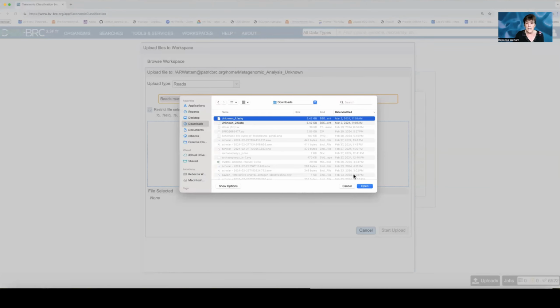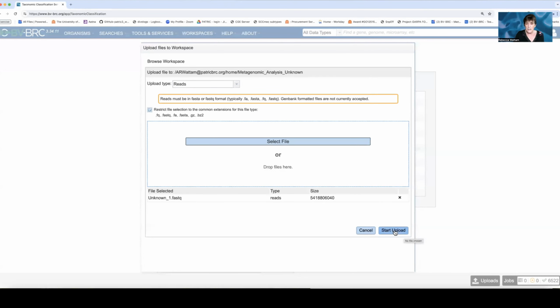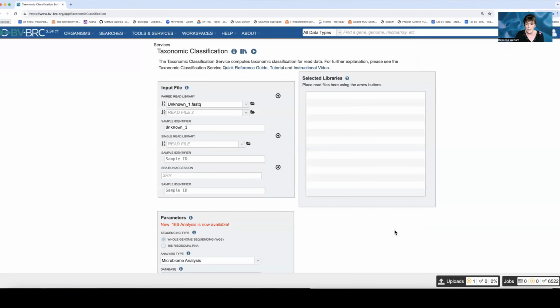So I'm going to click on that and say open it, and then I'm going to start the upload. Once the upload starts down here in the job monitor, you can see that it'll show the uploads. And if I click on this, it shows me it's trying to upload it, and it takes a while.